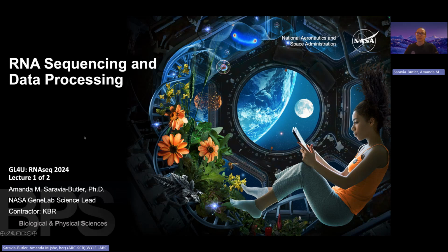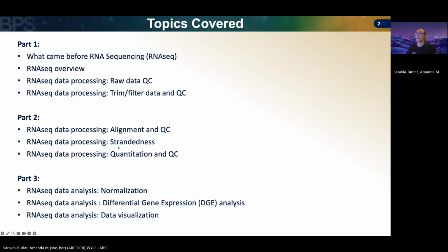So this lecture is going to cover RNA sequencing and data processing of RNA sequencing data. The topics covered here, I've split into 3 parts. After each part, I'm going to have you pause this lecture and do the corresponding steps in the hands-on activity Jupyter Notebook that covers the same steps that I go over here in the lecture.